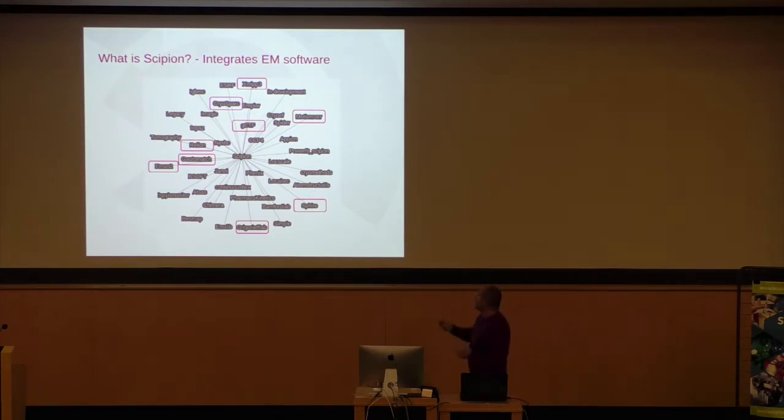But usually you do the first steps in a facility, so you can do MotionCor, or rely on MotionCor if you want. You can obviously estimate CTF. You can use pickers, different types of pickers, like crYOLO, which is inside the Sphire plugin. You can even reach extraction and even 2D classification. And at that boundary, I think is where online processing swaps to non-online processing, but you can still do it within Scipion.